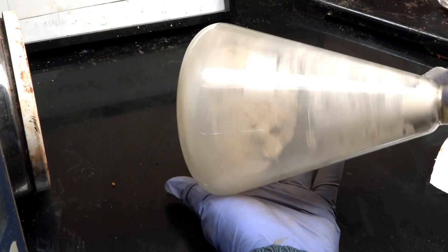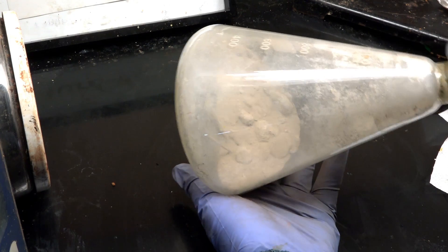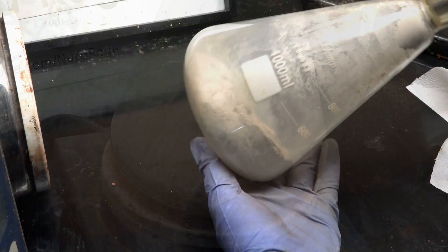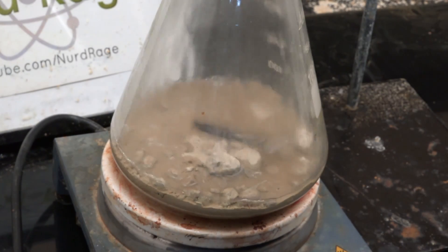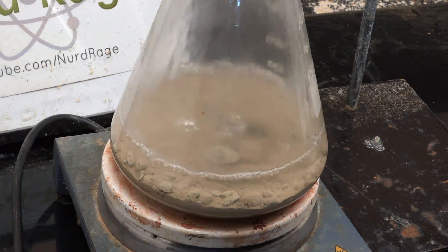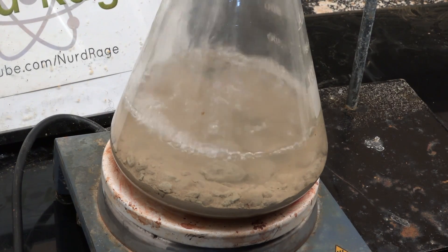Greetings fellow nerds. In this video we're going to make anhydrous iron chloride, also known as anhydrous ferrous chloride. This is useful for those reactions where you can't have any water but still want ferrous chloride. An example is the synthesis of chlorotoluene I showed in a previous video.